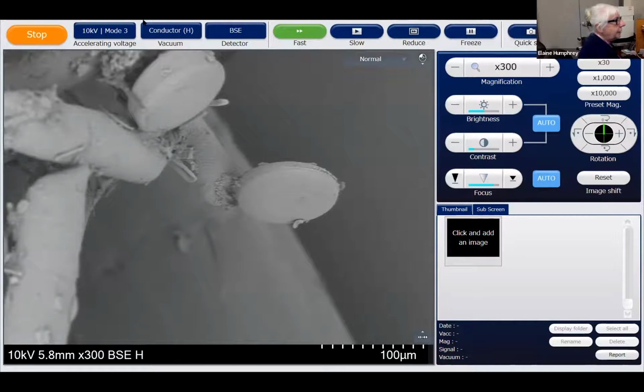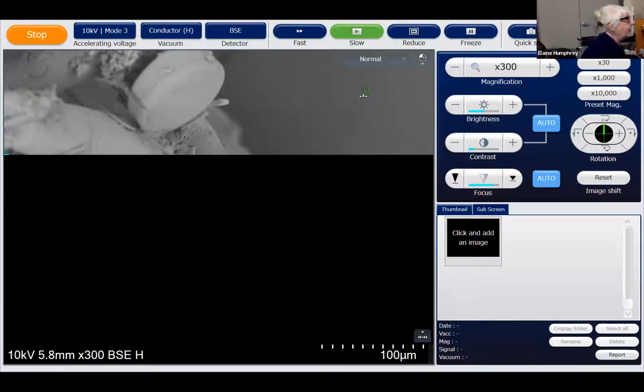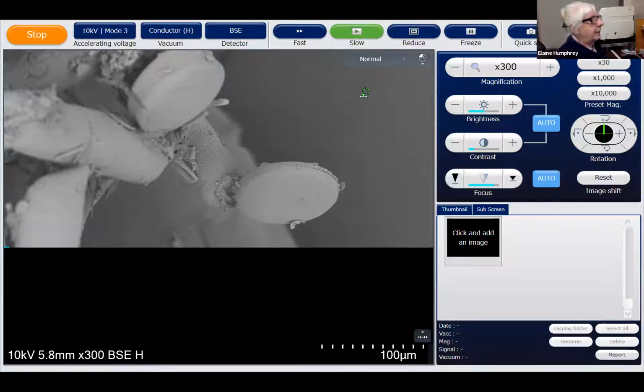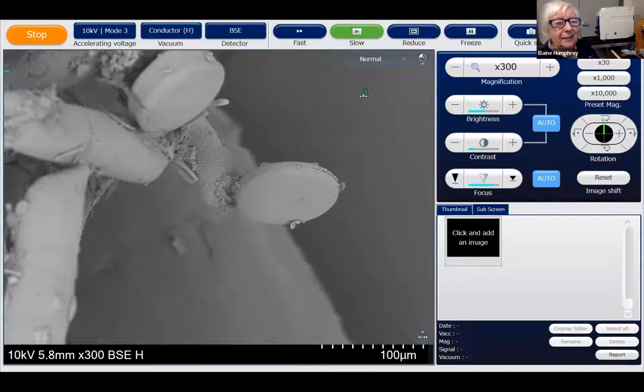So there's two here that are round, like a Frisbee. So they're very much like a Petri dish. And they're quite big too. So they're probably, now then, but there's two big round ones off Galiano Island. And one is called Thalassiosira, and you'll have them on Vashon as definitely. Thalassiosira and Coscinodiscus. And this one looks like Coscinodiscus.